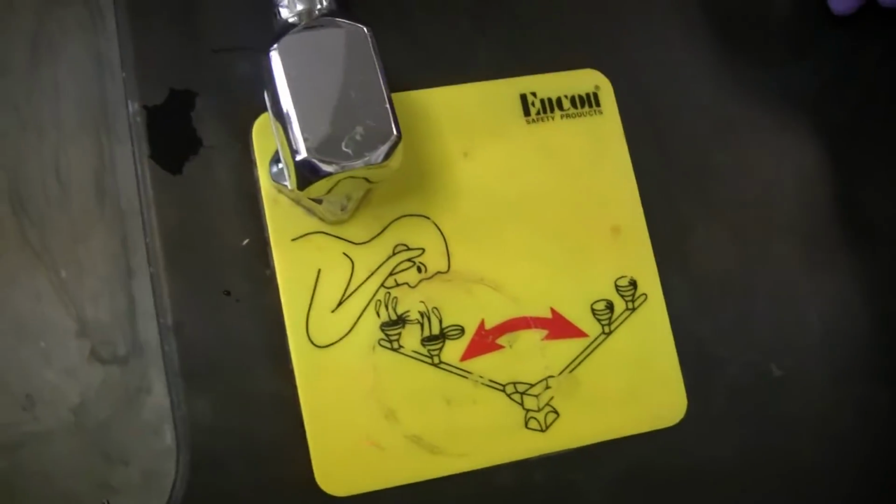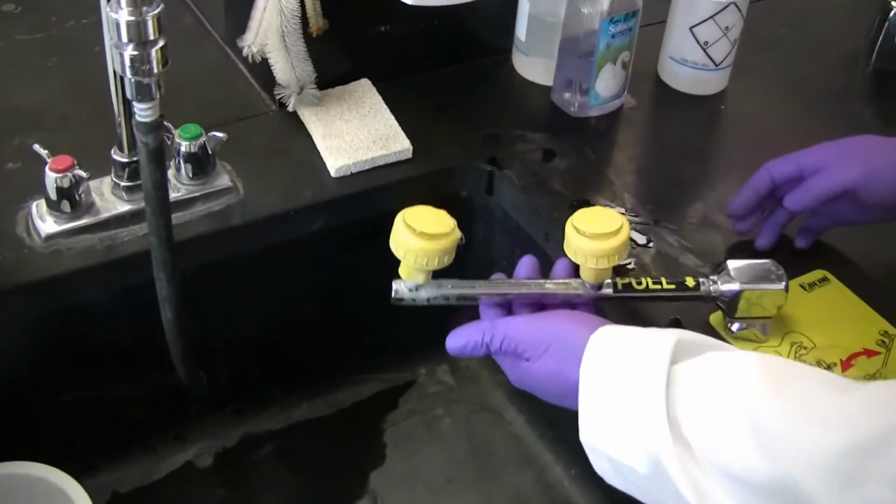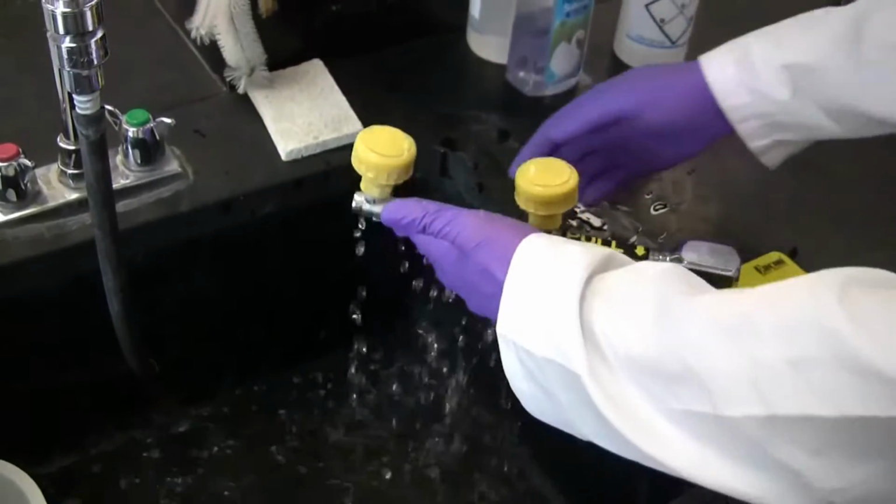If you or someone near you gets hazardous material into their eyes, take them to the eyewash station and pull the unit towards you. You need to hold your eyes open under it for 10 to 15 minutes.